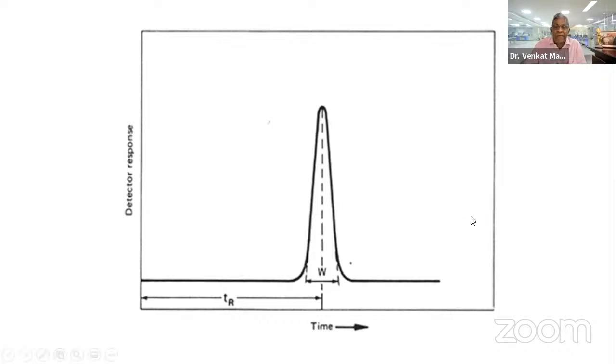Whether it is at 70% of the peak, or at 50% of the peak, or at 10% of the peak, at each portion of the chromatogram, the peak can be folded and juxtaposed. Both slope values are identical. This is an ideal chromatogram. It's an ideal chromatogram. Okay.